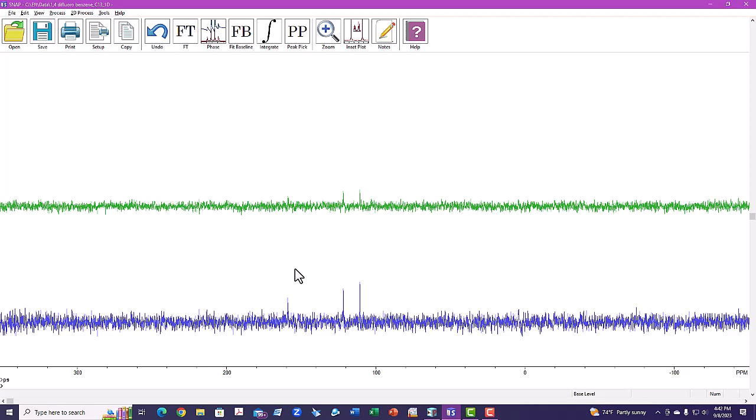Likewise, the protons near the CF atoms will be split by those nearby protons. So even though we're doing decoupling, that doesn't mean we're just going to get singlets and whatnot. So I'm guessing that the 2 tall peaks here are the 4 carbons that have protons attached. We're not decoupling protons, we're decoupling fluorines. And that this peak over here is the one with the fluorine attached, and it's coupled slightly to the hydrogens that are nearby. Let's load that into the buffer.